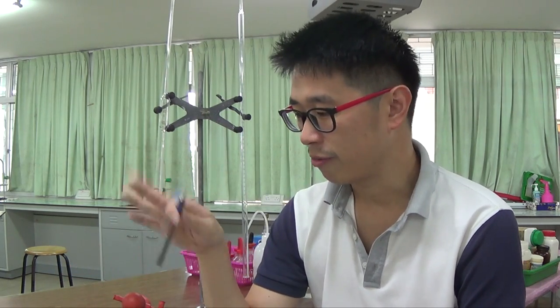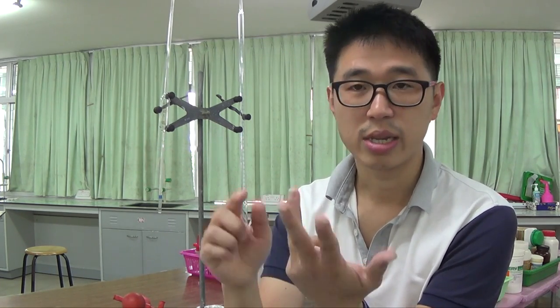Okay, so when I say experimental video, they involve me doing actual experiments, so you don't really see on the screen the usual paper walkthrough, the step-by-step tutorials, whereas this is more about the experimental skills, and I will highlight a couple of things as I do the actual experiments. It's all about observations, data collection, data analysis, including tabulation of data, how you analyze the data, and eventually the data processing, and what kind of evaluation you can get, which is to do with accuracy, percentage error, suggestions to improve the experiments, and so forth.